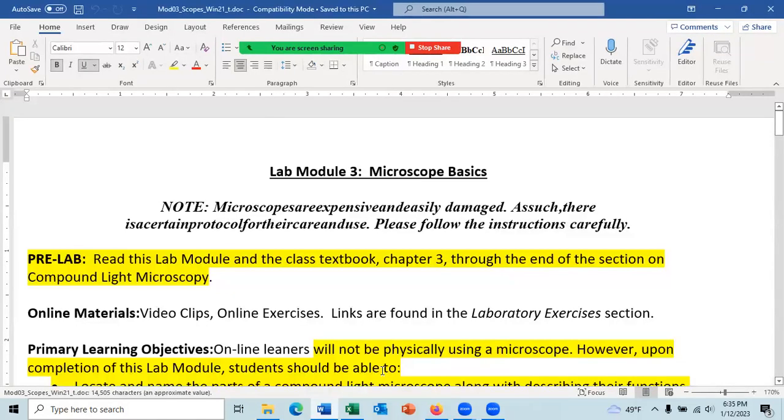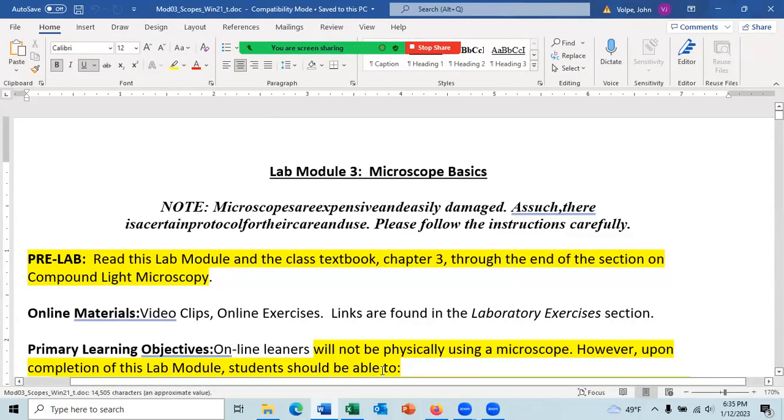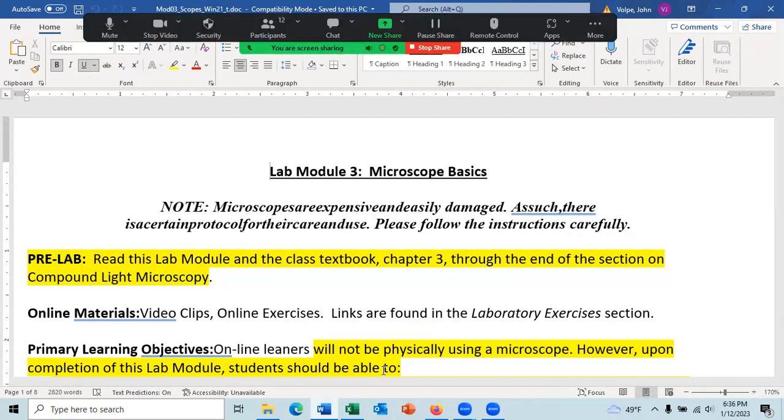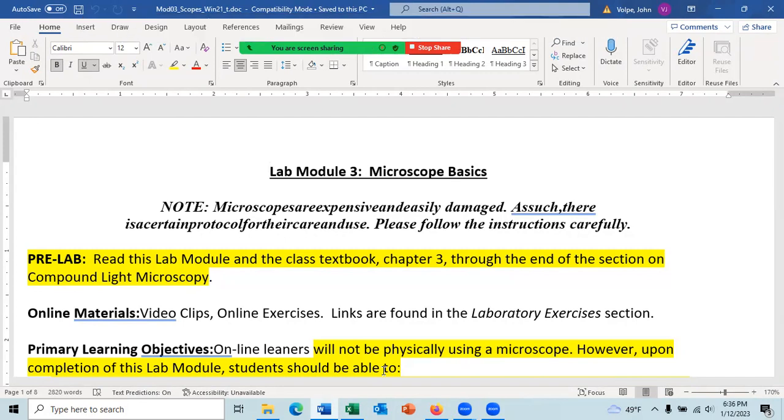Yes, I had one actually. Okay. For the results for the P1 and then the P2, the background on one side looks lighter than the other. And I'm just kind of confused. One of them looks kind of turbid, but the other one has a dark background and looks kind of cleared, but it just looks different because of the shading on the background.